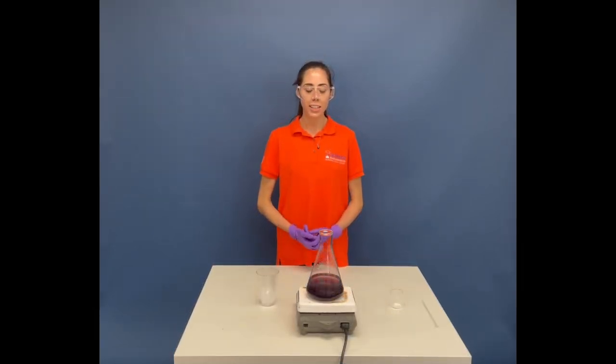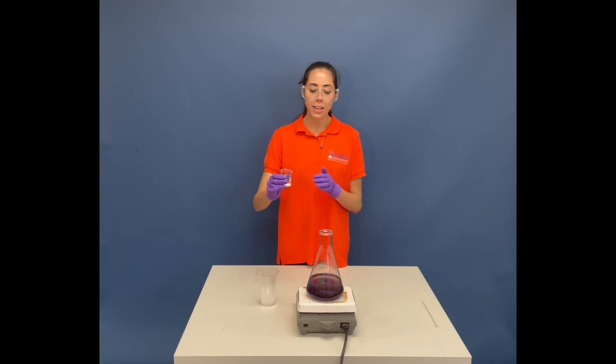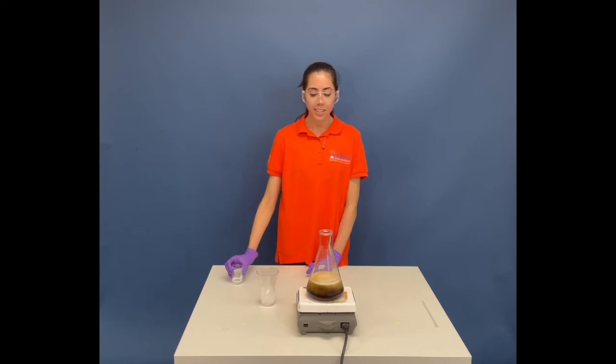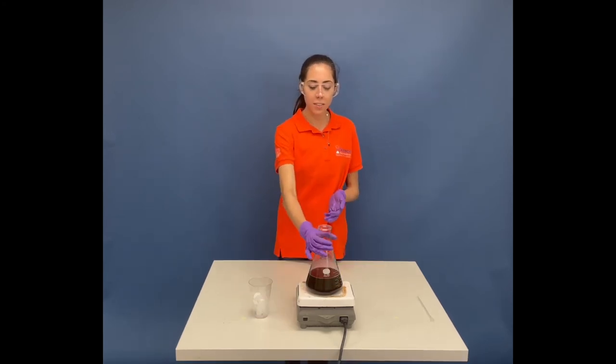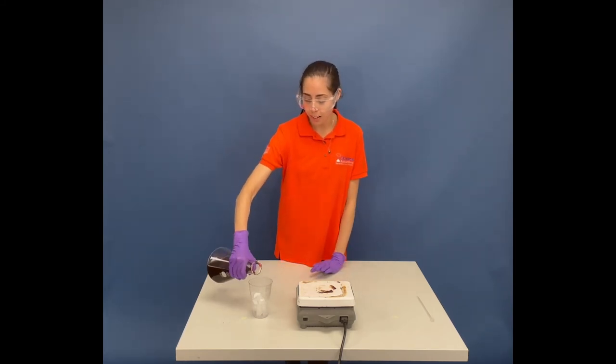Now that our oscillating clock experiment has stopped, what I'm going to do is add a little bit of a decolorizer — this is also known as hypo for those of you who have ever worked with photography. And I'm just going to add it here. As you can see, it might look familiar — it might look like Coke or Dr. Pepper, some sort of soda drink. It's kind of almost like grape soda. Just to show you how much it looks like grape soda, I'm going to pour it into a cup of ice.